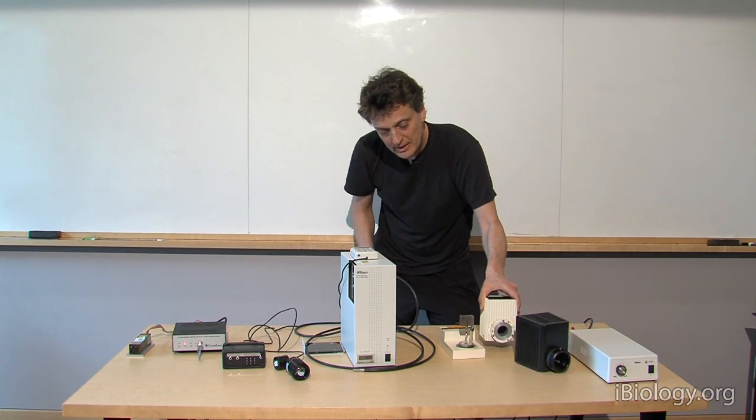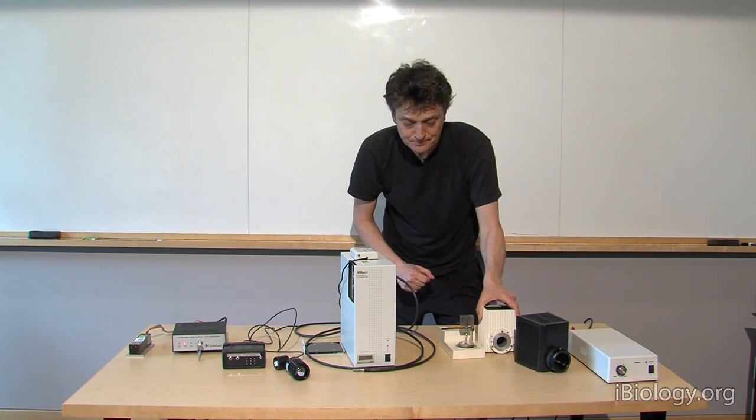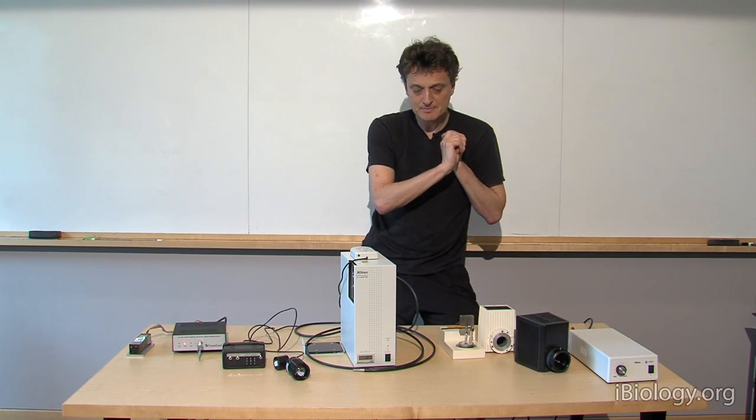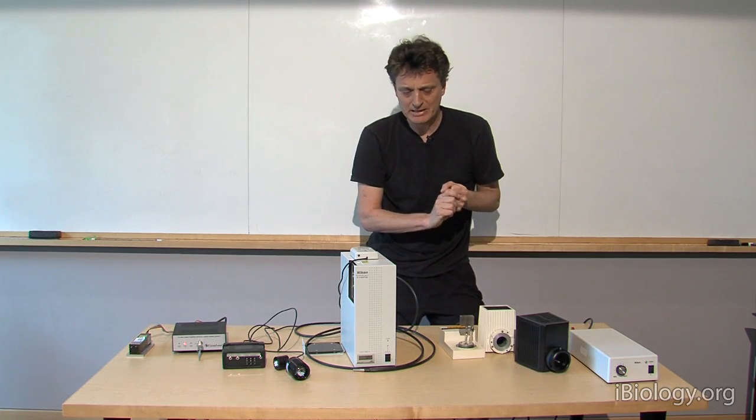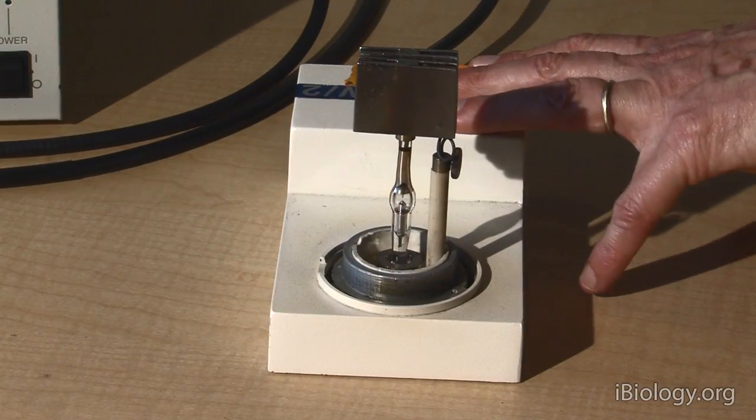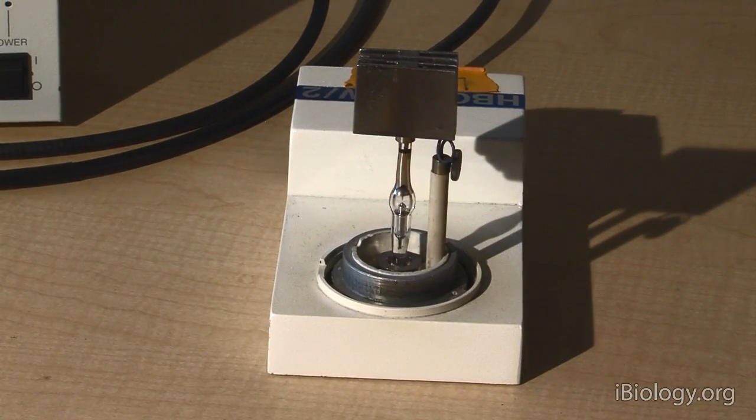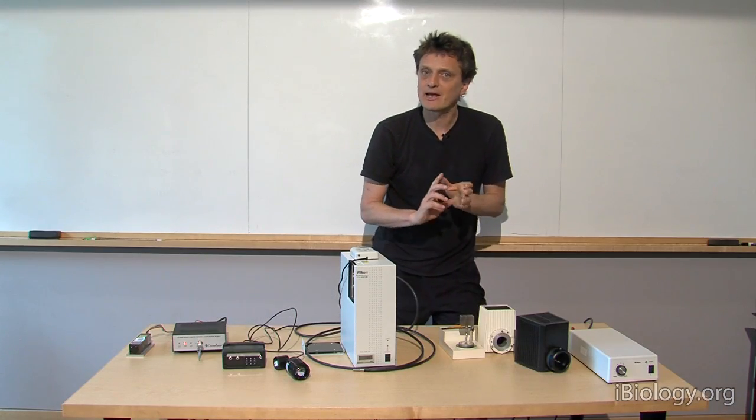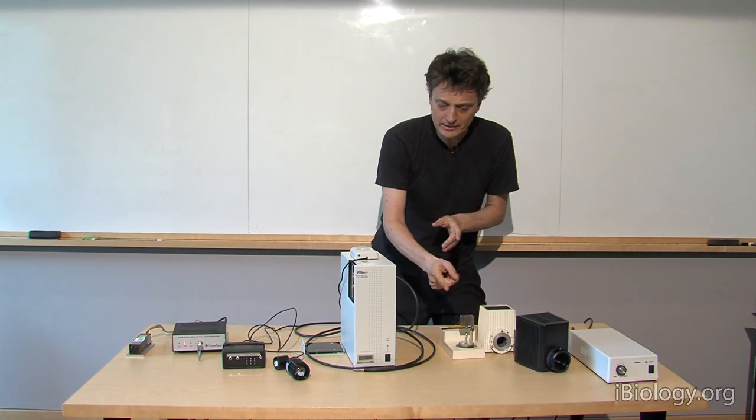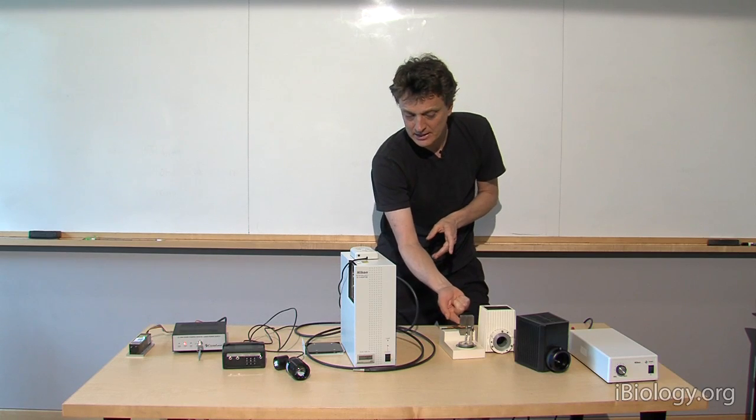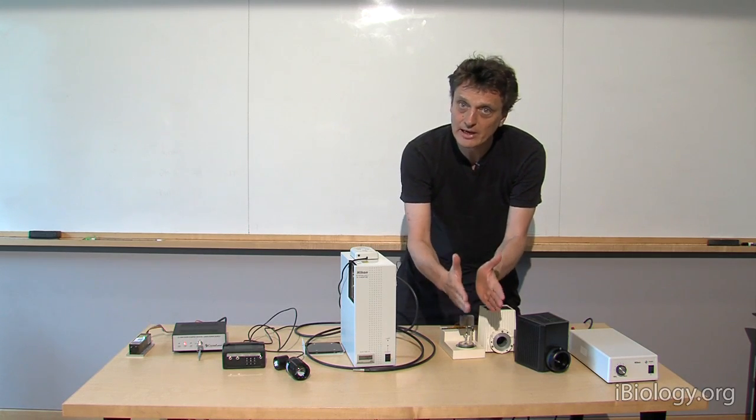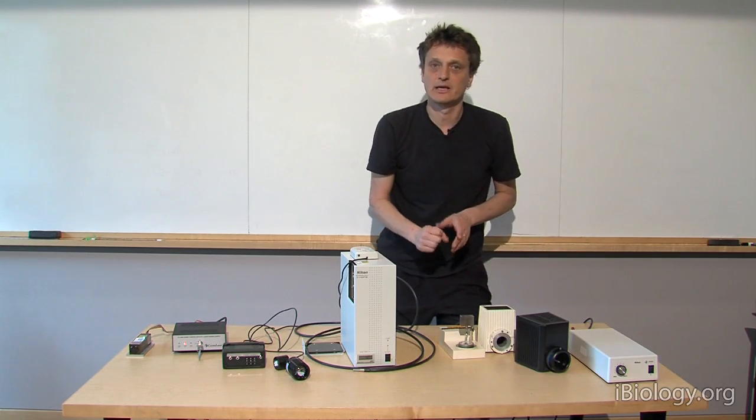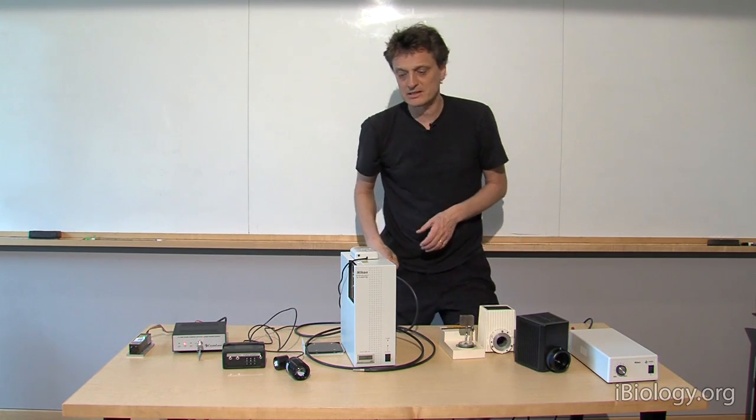We don't like them that much anymore and that is because you have to replace them after about 200 hours. Also when these things break, they are a big hazard. Immediately evacuate the room if that happens. And they are kind of a pain to align. You have to set them up so that this arc is positioned in the right place with respect to the condenser lens so that the light goes exactly through the optical path of the microscope.